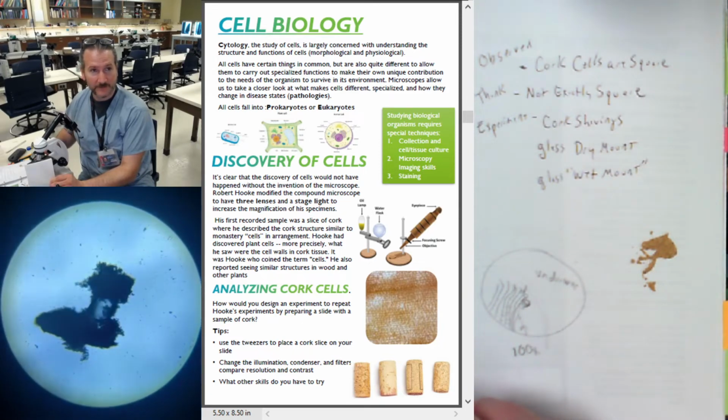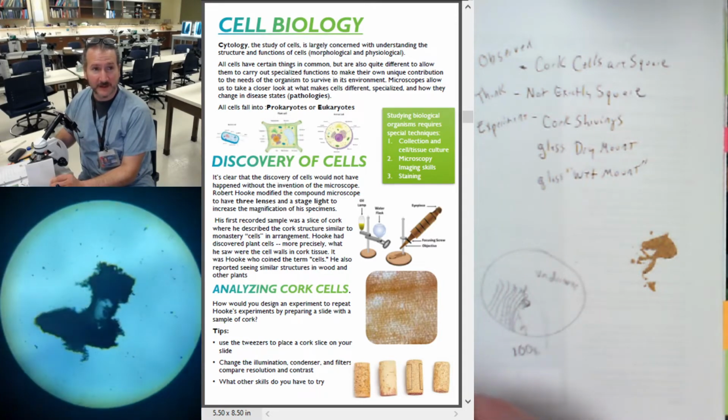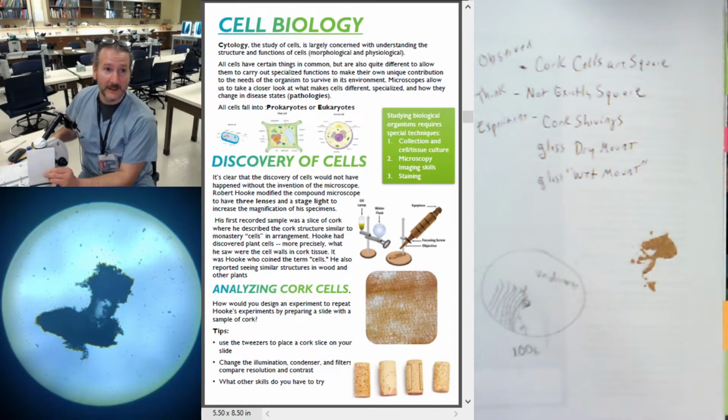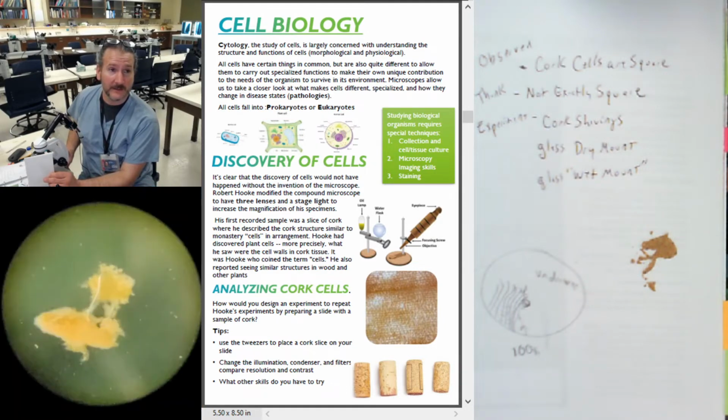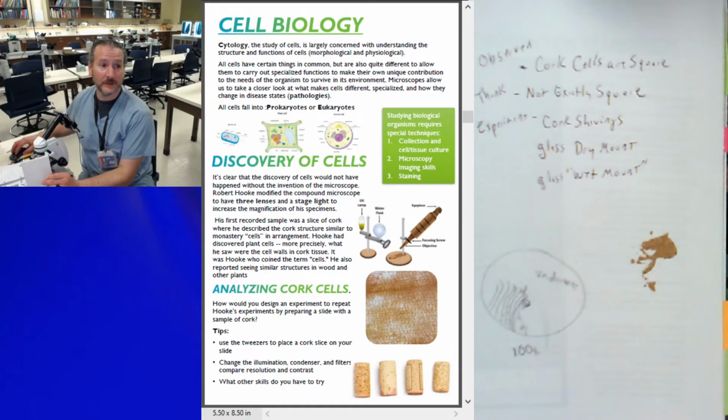Too much light. So a couple problems you have when you're working with water, by the way, is you don't have a lot of time because the light is bright and it's hot, and it will cause the water to evaporate, and then you're back to square one. Oh, scope just turned off. Sorry. You just keep looking.